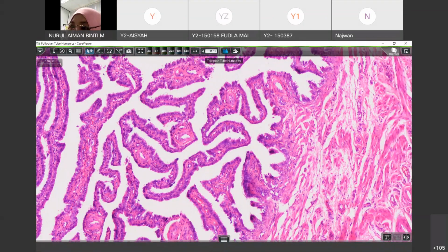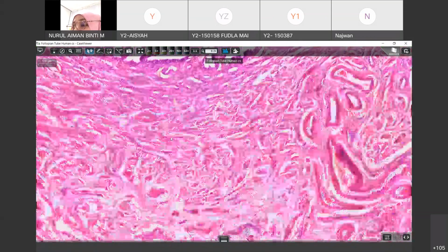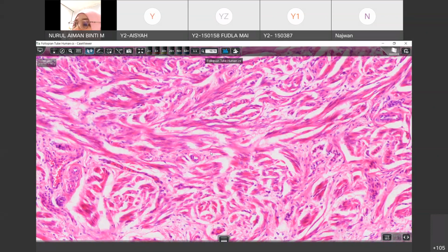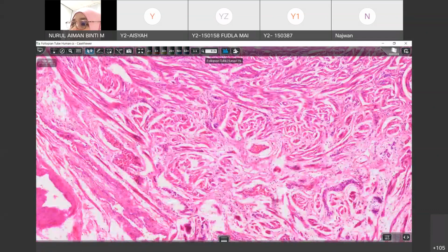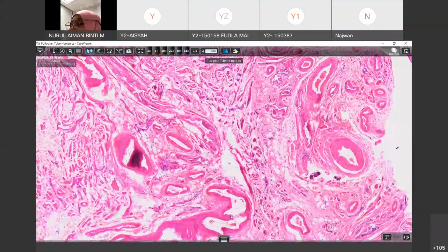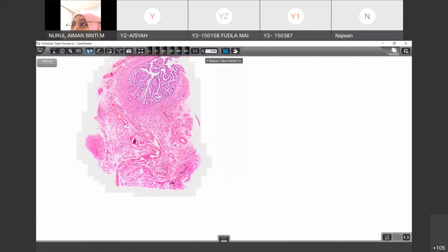Okay, so the outer part of the uterine tube is comprised of, again, not really a lot, but you have the smooth muscle in between. Okay, smooth muscle in between. Of course, you have collagen and elastic fibers, but you can't see them without specific staining. You also have a lot of blood vessels, the ovarian artery and ovarian vein, which will supply the uterine tubes.